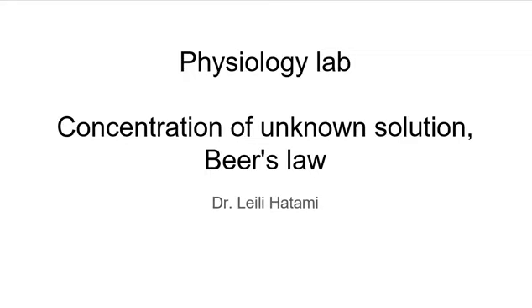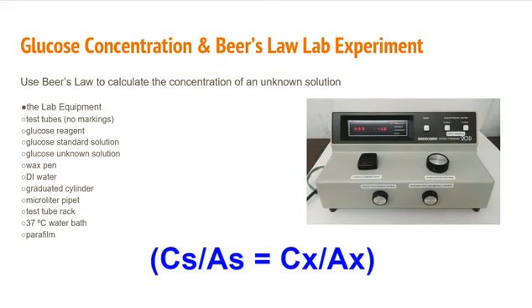Today we're diving into a classic experiment using Beer's law to figure out the concentration of an unknown solution. And I'm excited to walk you through it. Before we get started, here's what you'll need. We are going to measure the concentration of our unknown glucose solution by using Beer's law.